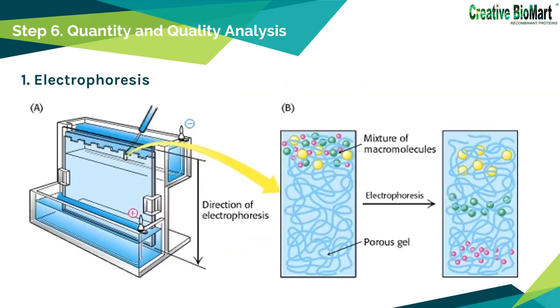After all the purification steps, how could we know our purification scheme is effective? Apart from specific activity rising in each purification step, another method is using electrophoresis to display the target proteins at each step. Proteins can be separated largely on the basis of mass by electrophoresis in a polyacrylamide gel under denaturing conditions. SDS polyacrylamide gel electrophoresis is rapid, sensitive, and capable of a high degree of resolution. We can examine the efficacy of our purification scheme by analyzing a part of each fraction by SDS-PAGE.